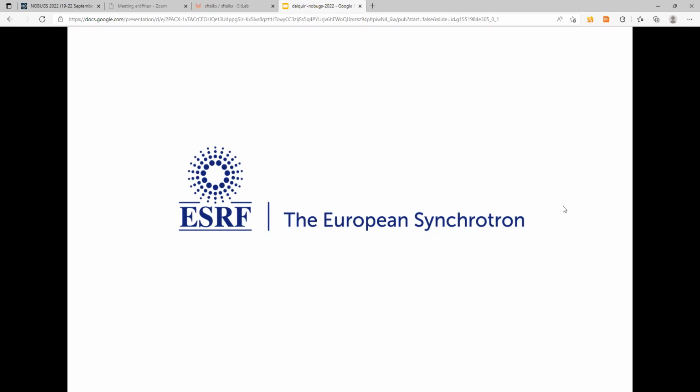Staff have access to their beamline, and it's up to you who you assign this to. Users can only access their sessions, but beamline staff can access all sessions on that beamline. And we have a grace period as well, because sometimes staff want to access a proposal that's about to start, because their users have arrived the day before and they want to start setting up samples and things like that. So we have grace either side of when the session actually starts. Right, thanks.